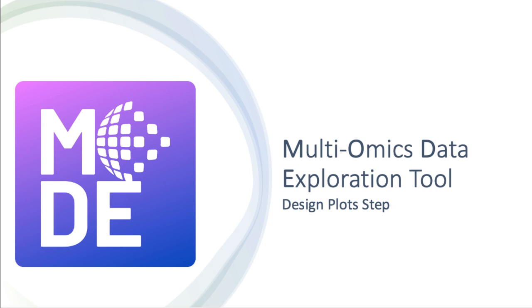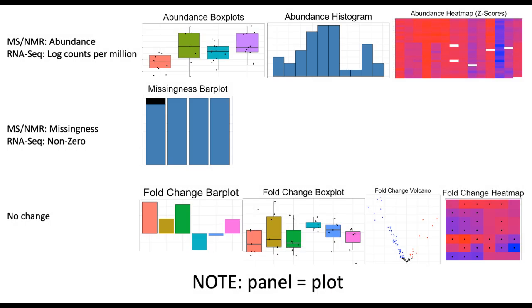Hello. In this video, we will cover the many plot options for omics data in mode, and how to make each type of plot. There are 8 plot types in mode, with slight differences between RNA-Seq and mass spectrometry or nuclear magnetic resonance data. As a reminder, in Trelliscope, the term panel refers to a single plot. Here, the terms panel and plot are used interchangeably.